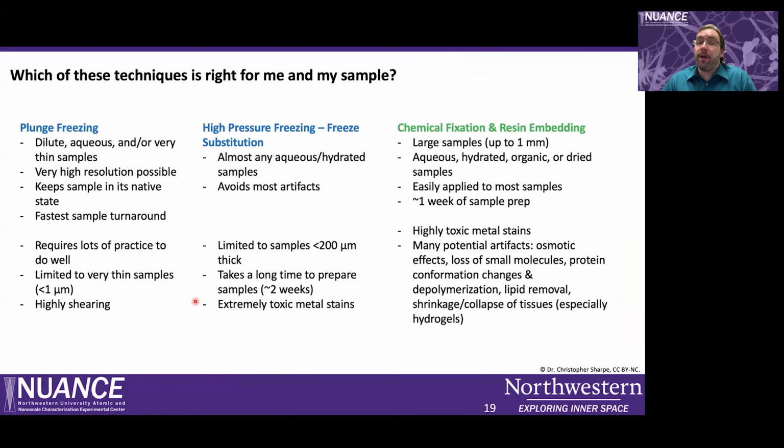Plunge freezing is going to work really well for dilute, aqueous, and very thin samples. If your sample isn't fairly dilute and in aqueous phase and very thin, it's probably not going to work at all. Additionally, it's not going to work very well if your sample is highly sensitive to shear.